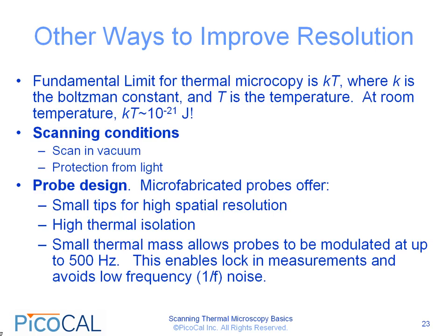A very important way to improve the resolution is through the design of the probe. Microfabricated probes offer small tips for high spatial resolution. They also offer very high thermal isolation, which increases the sensitivity of the scan. Most importantly, the small thermal mass of the probes allows them to be modulated at up to 500 Hertz for doing lock-in type measurements. And incidentally, it also avoids the low frequency or 1 over f noise, which plagues many types of measurement systems.